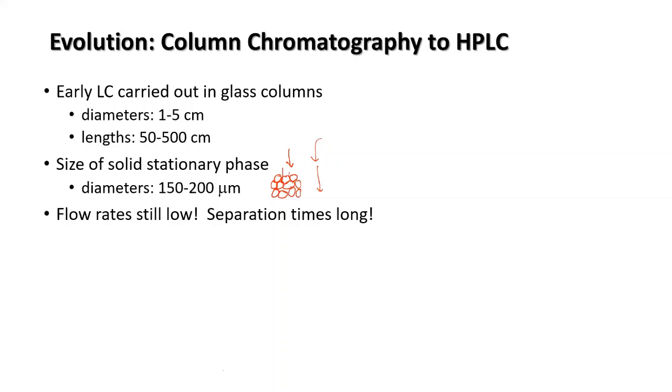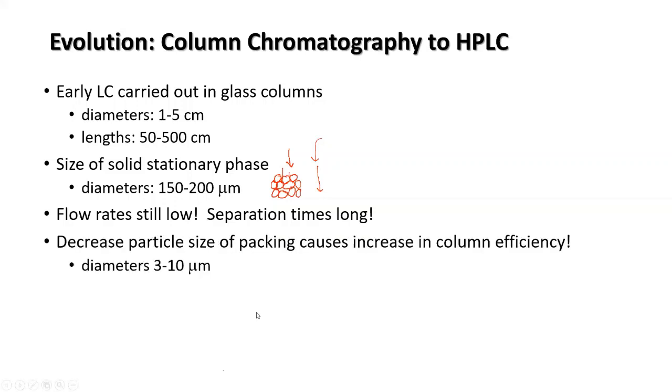So we need some kind of modification. Now, one more thing is that if you decrease the particle size, the interparticle gaps will be very less. So the particles will be well packed, and that will further decrease the movement of the solvent.